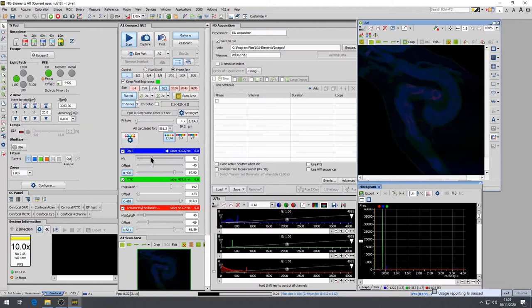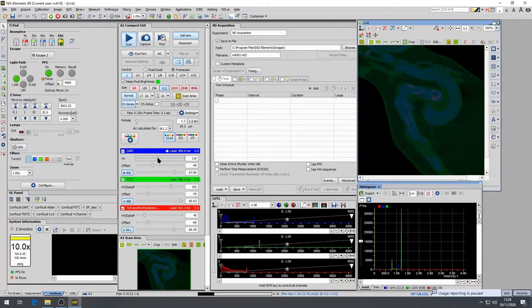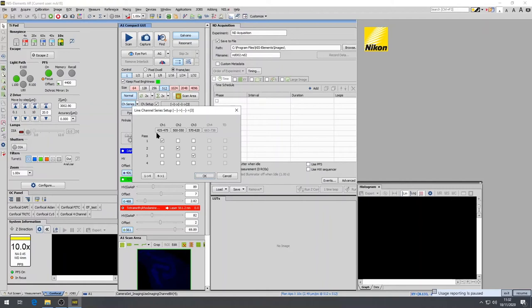Therefore, it is recommended to scan sequentially to reduce the chance of channels bleeding through. And that is achieved by a specific button, which is the channel series found in the A1 compact GUI. When channel series is selected, then the option to select each individual channel is enabled. You can choose which one you would like to scan first, and then you can modify the order for each channel.